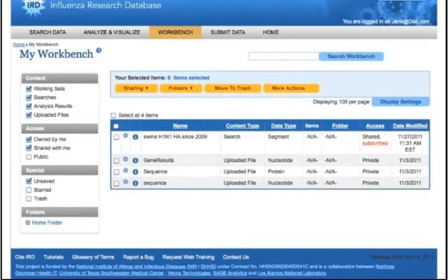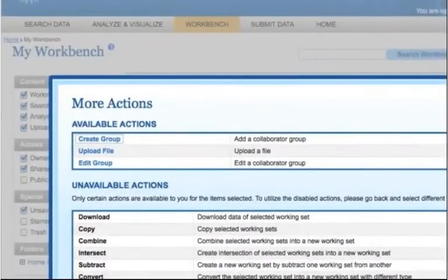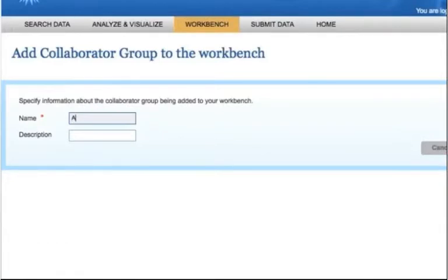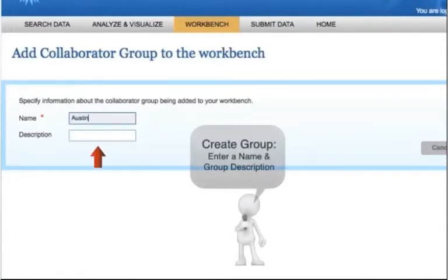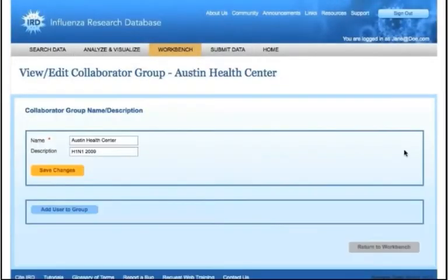In order to create a group, click on the More Actions button just above the top of the Workbench table. Then click on the Create Group link. Type the group name and description and then click the Create button.